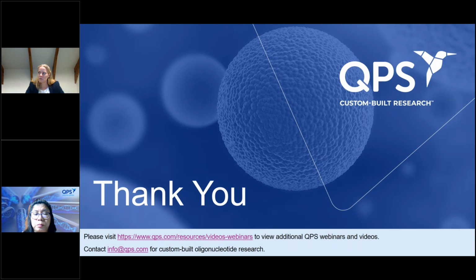And how long does it take? So normally, if we design the probes and we have to order them, it takes 2 to 3 weeks before we receive them. Again, you have to test the individual combinations. And then if you know the right combination, you order a big bulk of that. So then it will take another 3 weeks before you receive them. So it's not many more days you need in the end, but the timeline is a bit longer because you need to order the oligos.